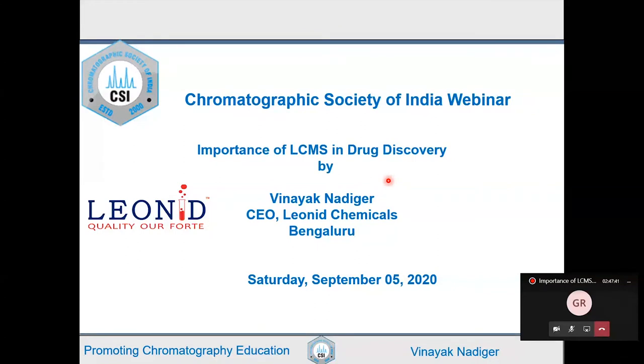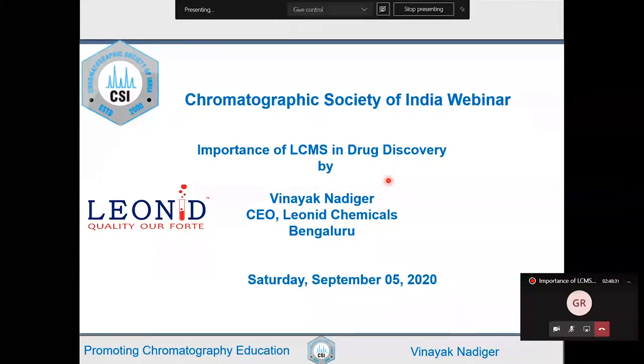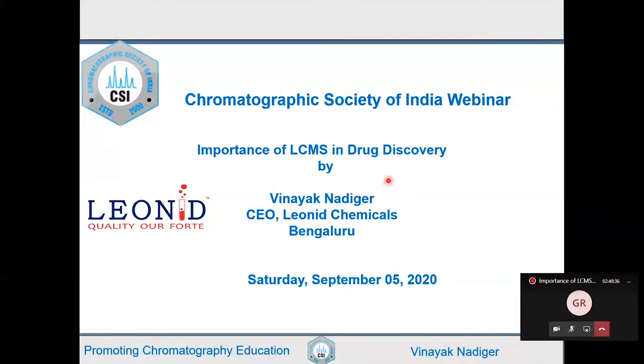Now, mass spectrometry, earlier, was only a structure determination component of the science. But later on, the evolution turned it into one of the useful detectors. What I was trying to say was that in the olden days HPLC had a UV detector, and then other detectors came. So mass spectrometry evolved itself as a detector. It was very thinkable that the MS can be coupled to LC like a UV, so it became LCMS. Don't think of LCMS as something different from the chromatographic technique.